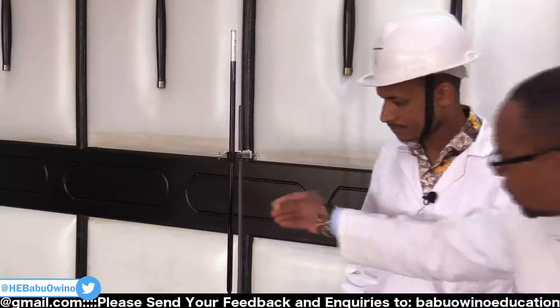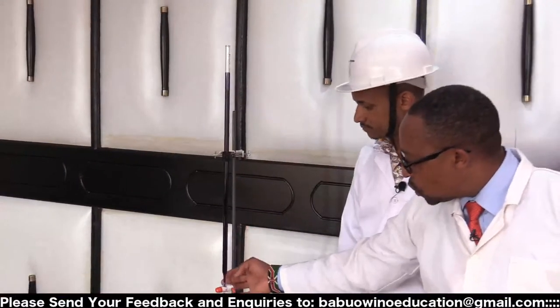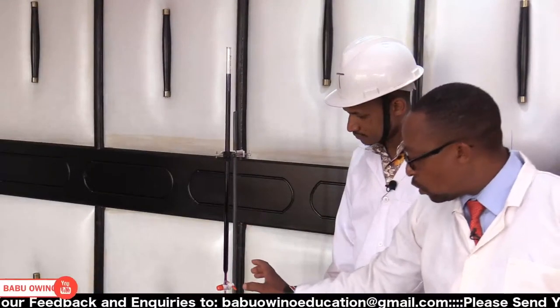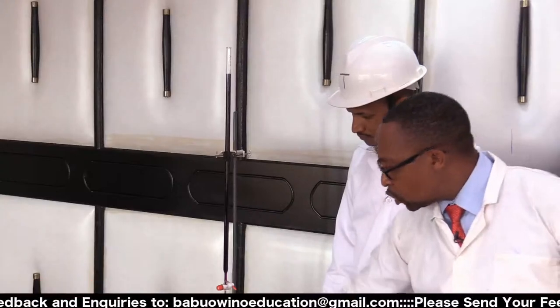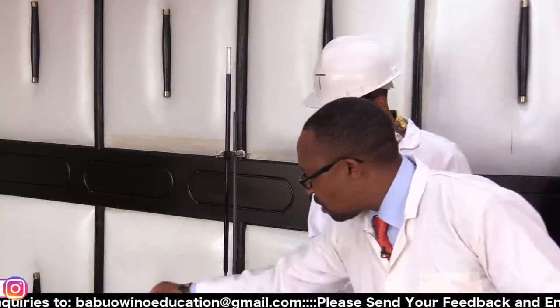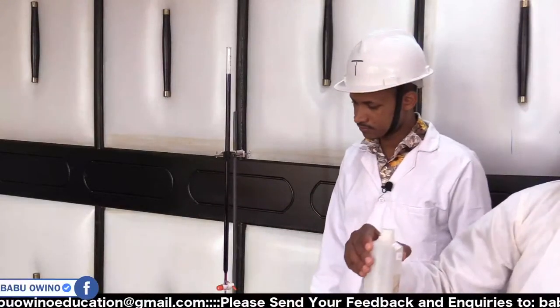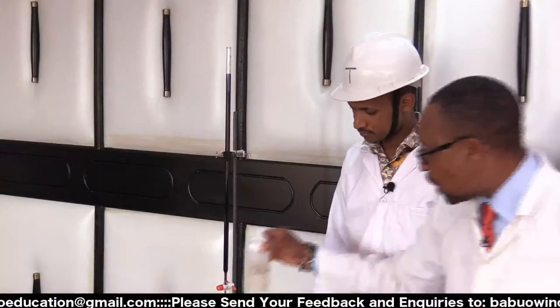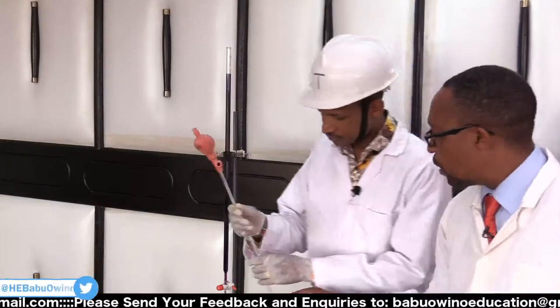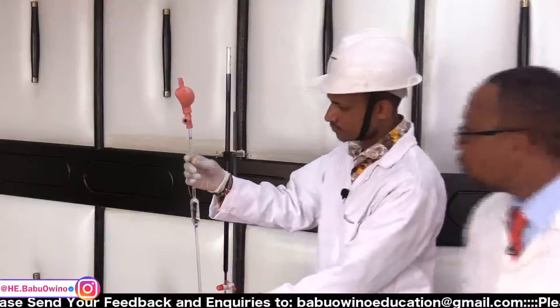Now you can see why it is important to fill this part, so that your burette does not give you confusion and your readings are accurate. Then from there, this is ammonium ferrous sulfate, which we are combining with. So you pipette this solution.